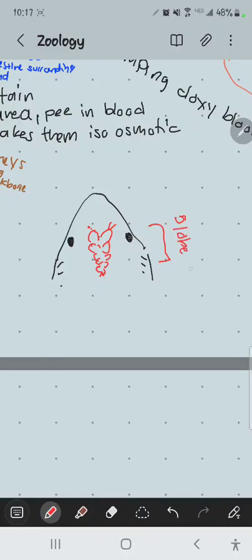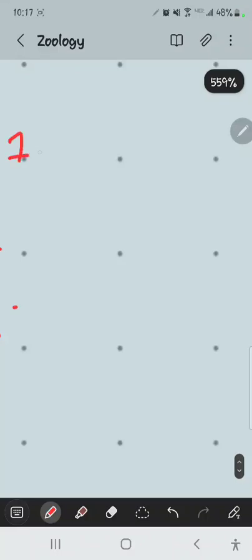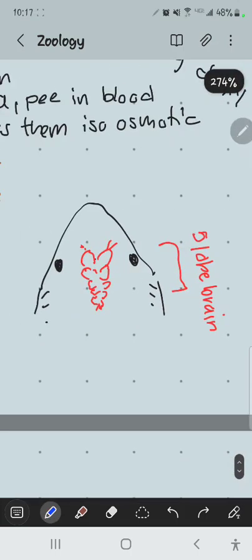The first thing you're going to probably see, well, let me just label these and then I'll tell you what you're going to see, is the first lobe here. Let me use blue here for my coloring. The first lobe here is called the telencephalon.